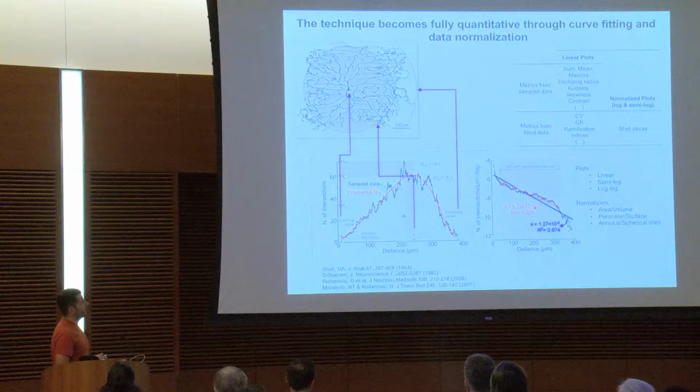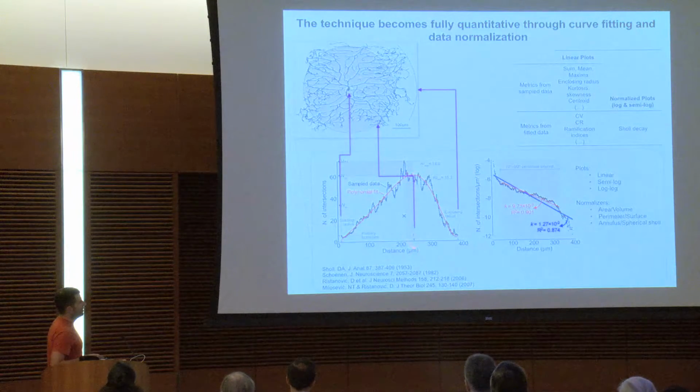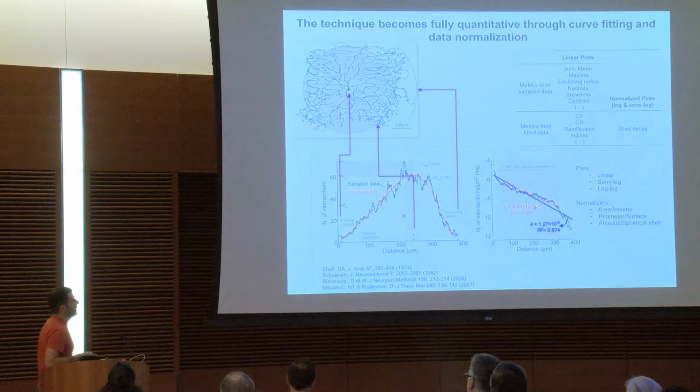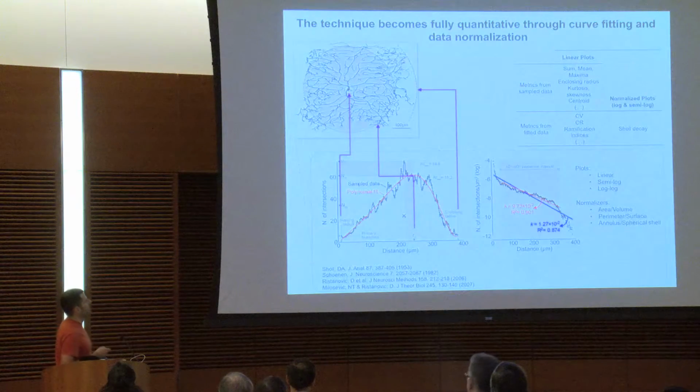from samples, you have to modify your sample data in a way that makes it much more informative. So in this case, we have a heuristic mechanism to establish the best fit polynomial, and we are able to detect certain features of the profile, such as its maximum, the distance where it occurs, the center of mass. We can also extrapolate the number of primary branches, which is important in anatomy, and establish the arborization index. And this is based on the initial sampling distance.